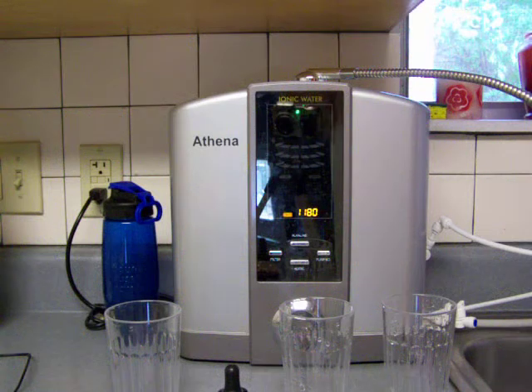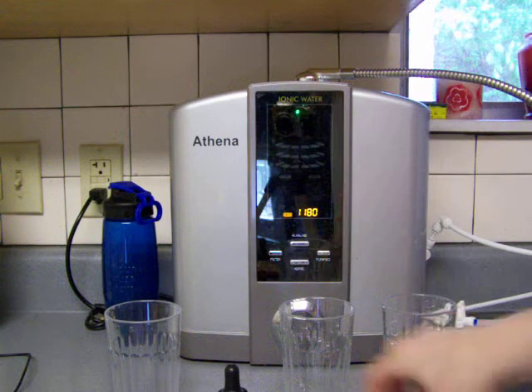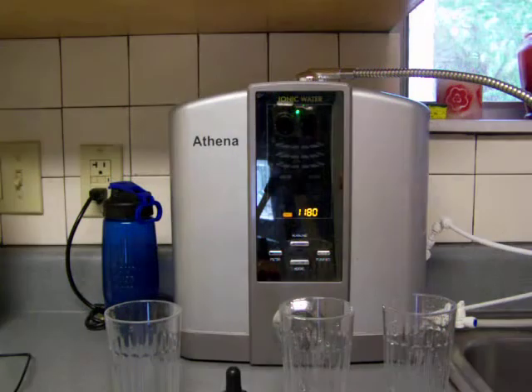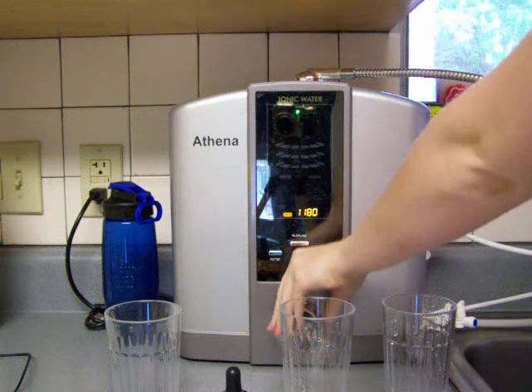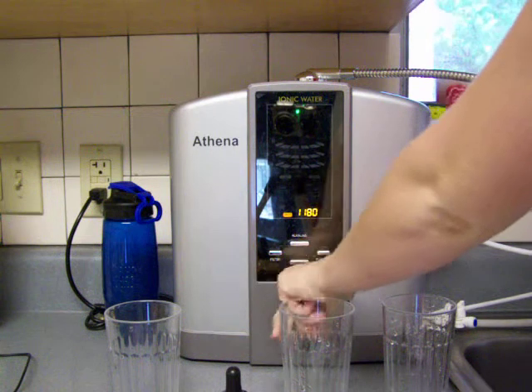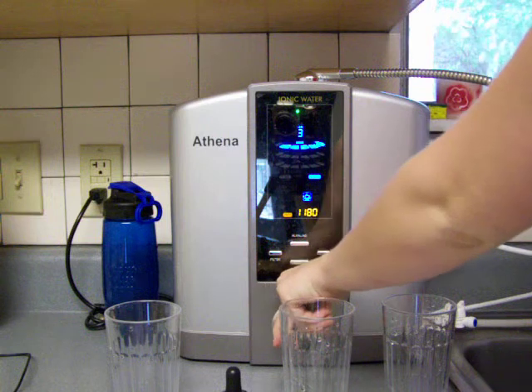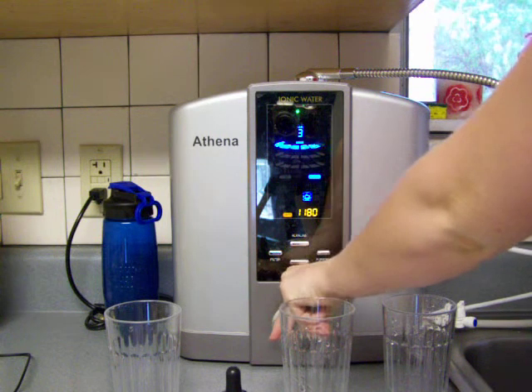This is Susan from Alkaline Water Plus. I'm going to do a little experiment between our pH drops in the small bottle that we sell and the pH drops in the bigger bottle, just to see which one is more accurate — we're going to test it against our meter. I'm going to pour the same amount of water in each glass from the same flow rate so that everything is the same.